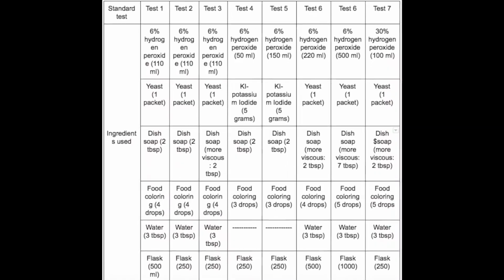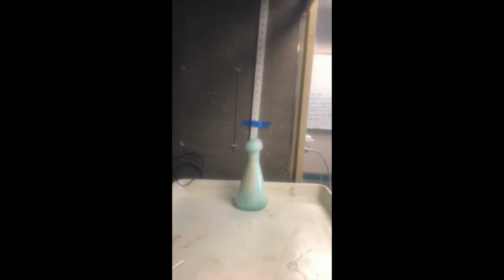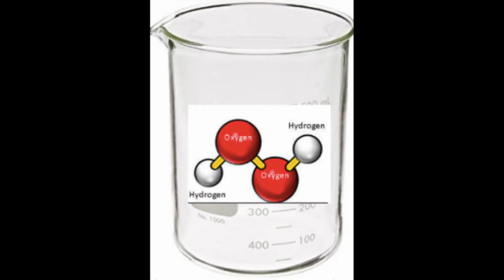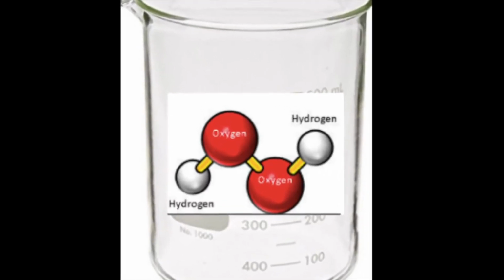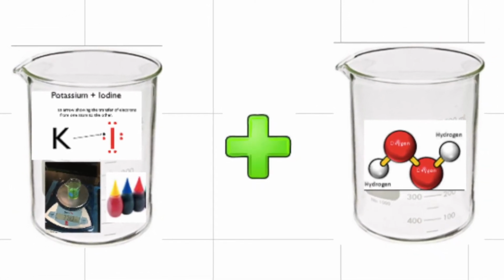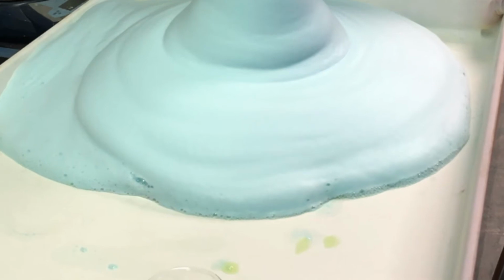We then recorded the results and repeated each time, manipulating a different variable. After a while, we realized that this didn't really work, so we tried to change our catalyst and formula and attempted to make a more reactive reaction. To try something else, we used potassium iodide. To do this, you measure out the appropriate amount of hydrogen peroxide, then you mix together the soap, potassium iodide, and food coloring. You mix them together and record in the same fashion as the mixture above.